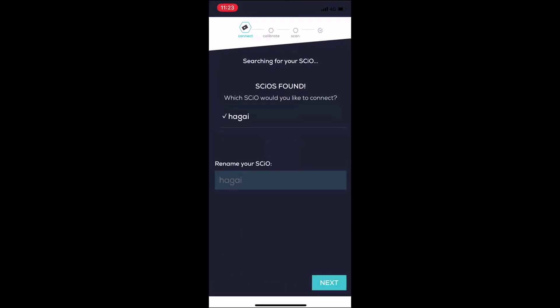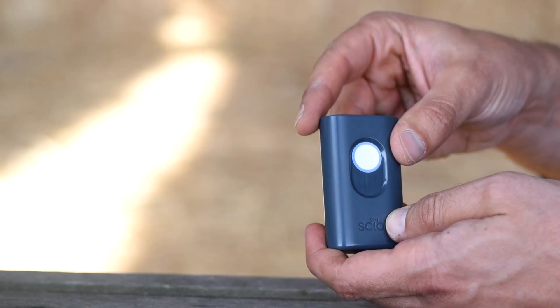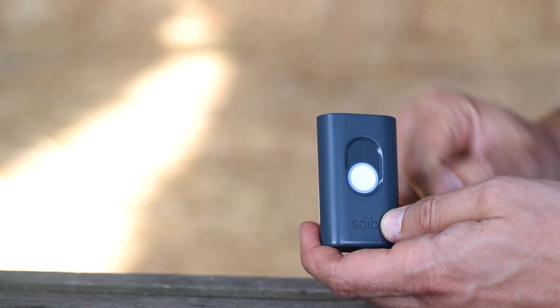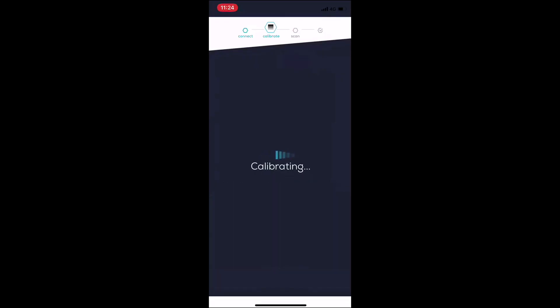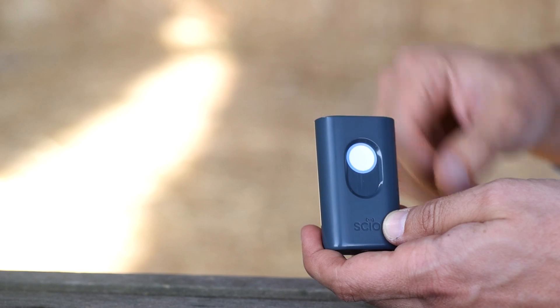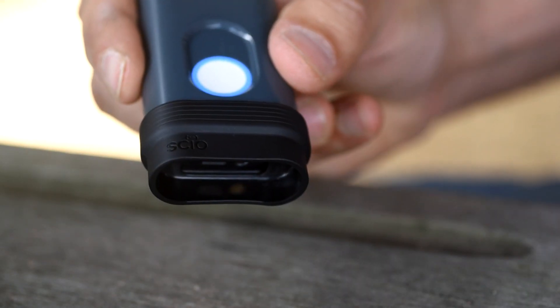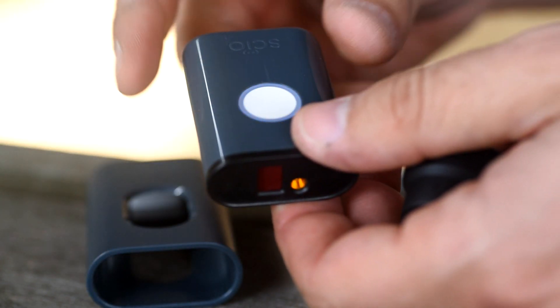The next step is calibrating Sayo. To calibrate, turn Sayo and put it in its cover with the sensors pointing in. Tap calibrate. Once calibration is complete, don't forget to take it out of its cover and turn it back with the sensors pointing out. Before scanning, attach the rubber shade to Sayo with its cover or without it.